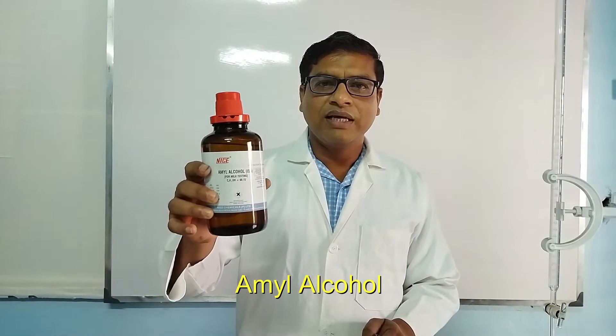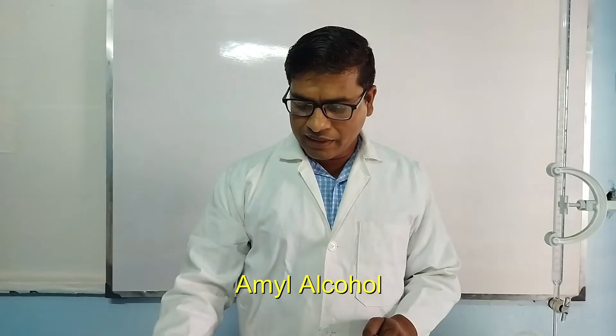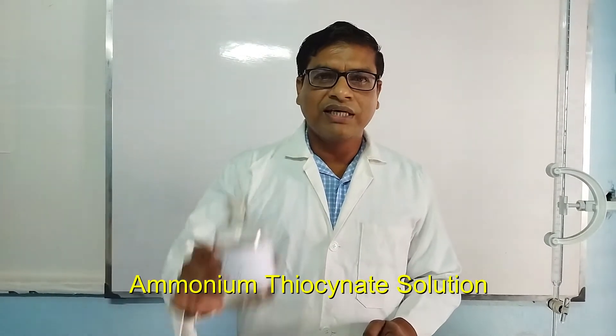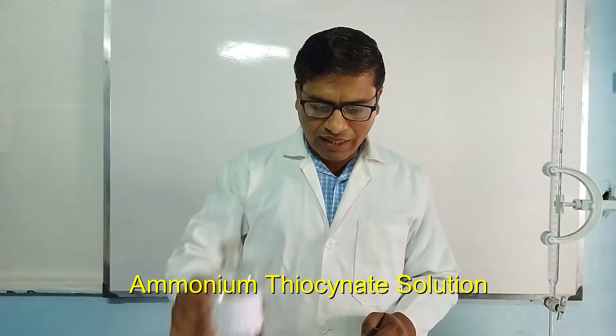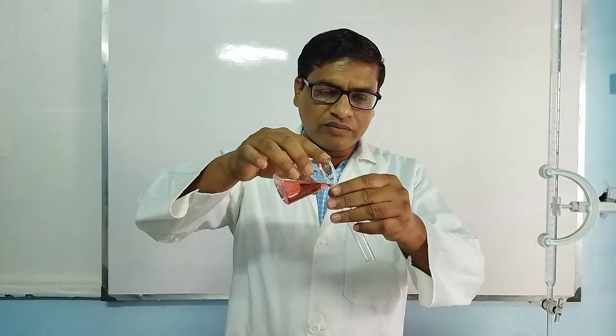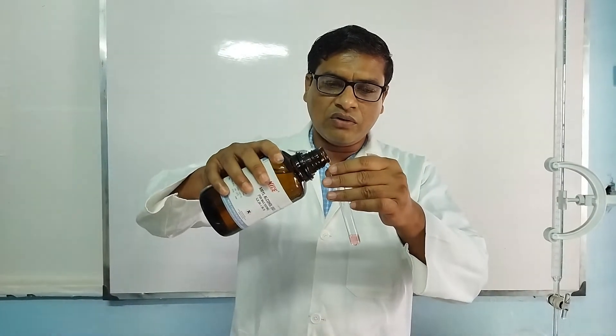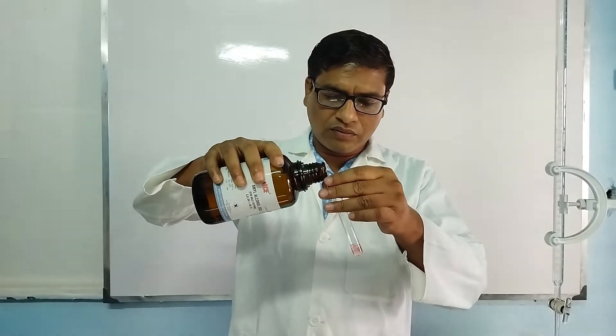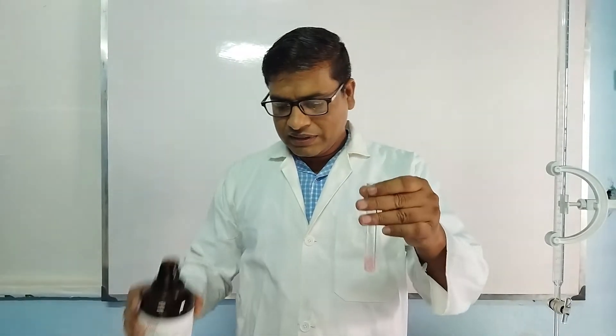I am using amyl alcohol and ammonium thiocyanate as reagents. I am taking a small amount of cobalt salt solution in a test tube, and then adding a small amount of amyl alcohol. Shake it well and we found that two layers are formed.